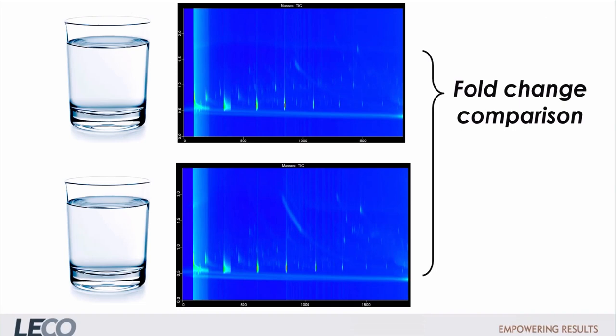For this project, we use the Fold Change option in ChromaTOF Tile. This can be done with only two samples, so it works well for these types of direct comparisons.